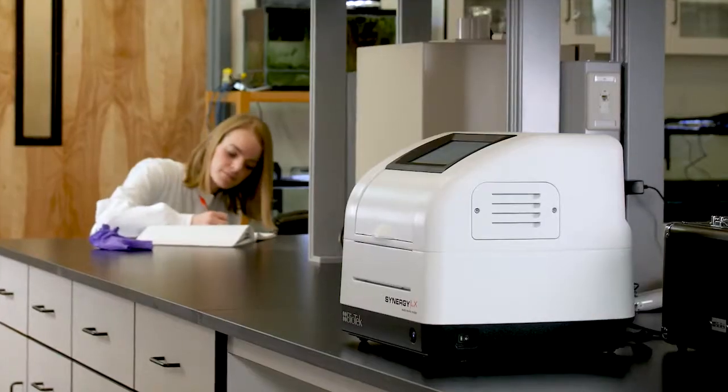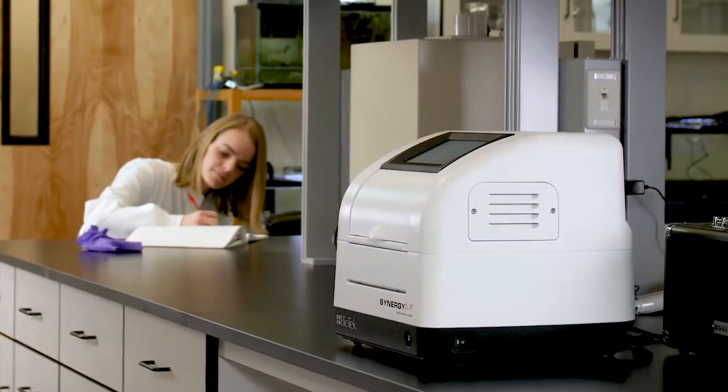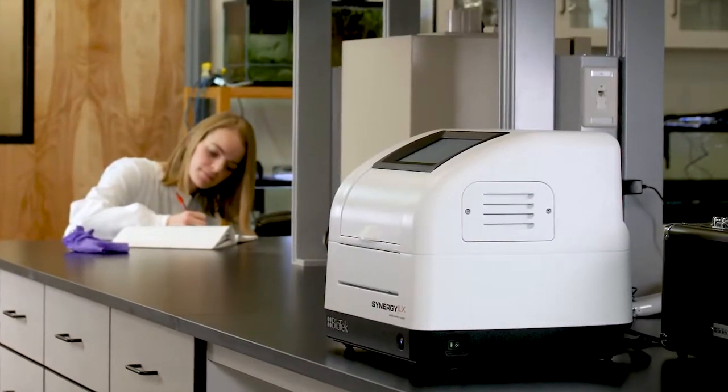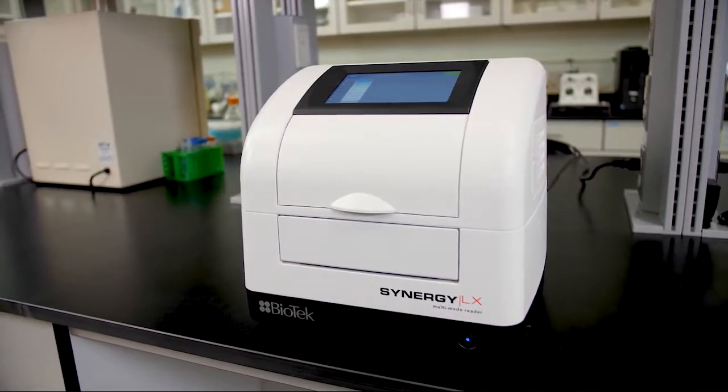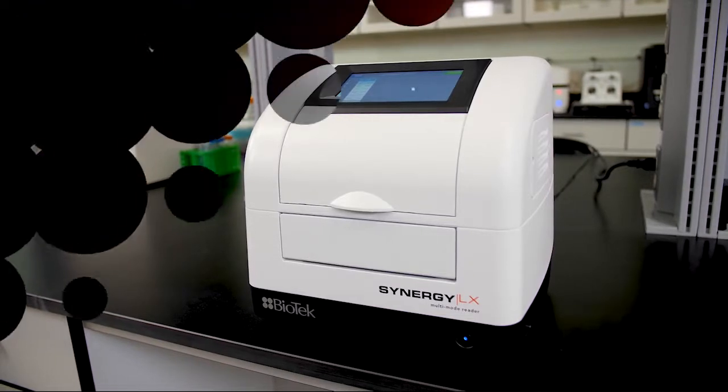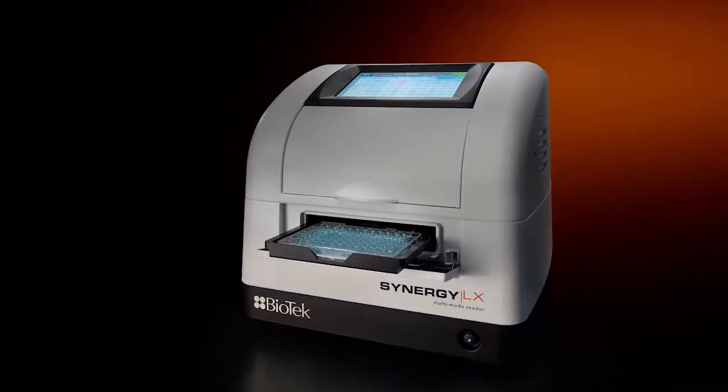At about half the price of similar instruments, Synergy LX is the solution for labs looking for an easy-to-use microplate reader that offers uncompromised performance for UV-Vis absorbance, fluorescence, and luminescence assays.